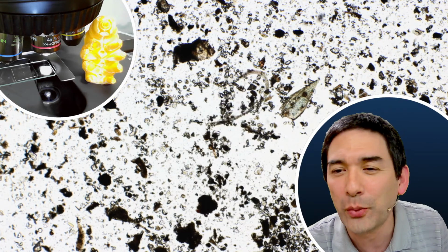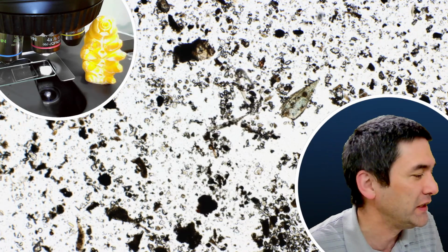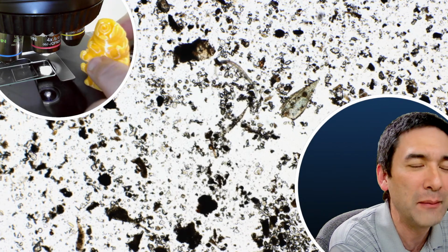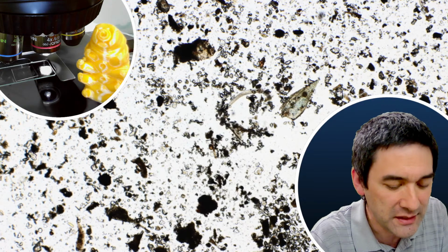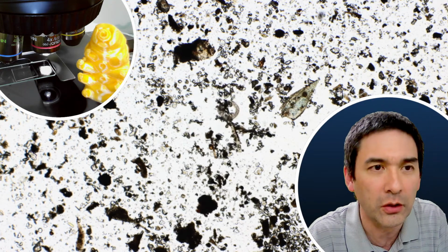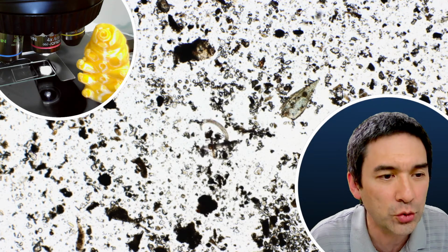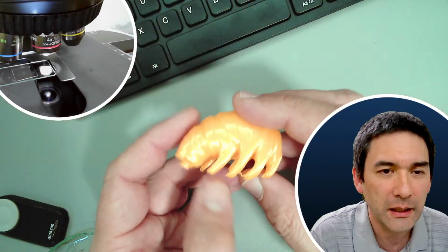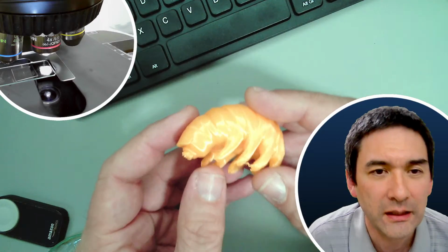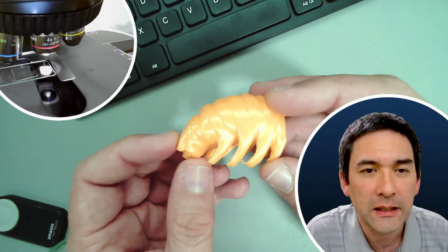Yeah, there is already a question. Why is there a yellow tardigrade here on my microscope? So I'm going to quickly show you this one over here. Okay. Because this is a 3D printed model of a tardigrade, which I would like to share with you. I simply would like to show it to you, because it kind of illustrates a little bit how it actually looks.